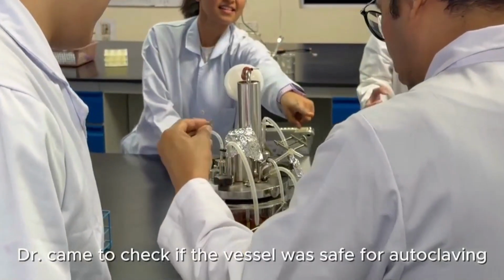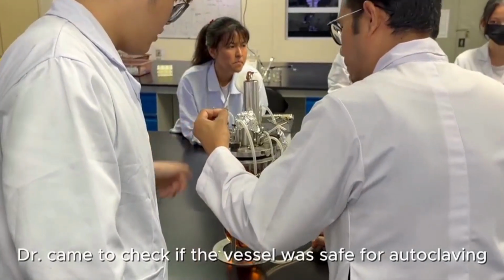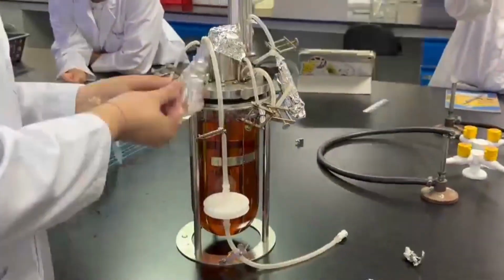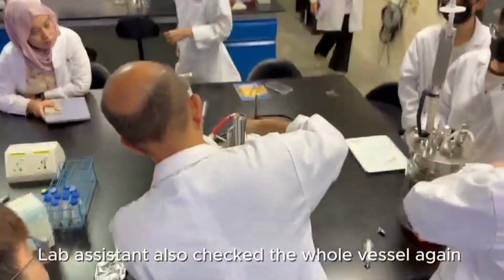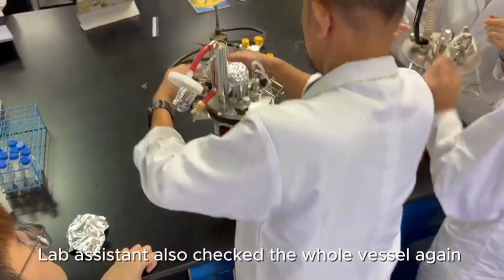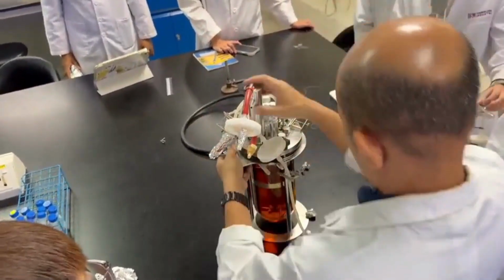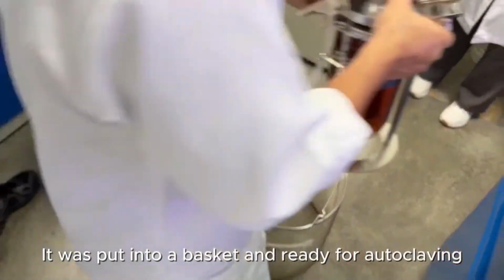The doctor came to check if the vessel was safe for autoclaving. The lab assistant also checked the whole vessel again. It was put into a basket and made ready for autoclaving.